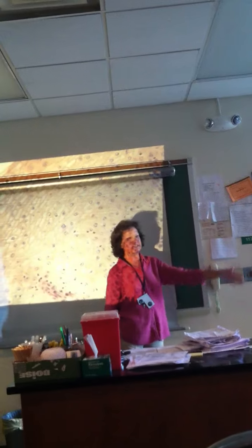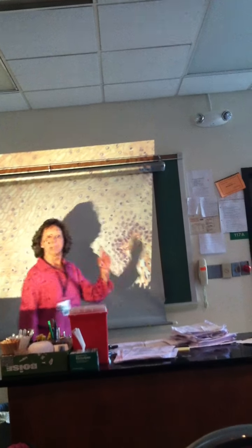This is a nice slide. This tissue you were assigned. I want you to look down here. There's something going up and down and up and down. What is that? Oh, I'm not asking what tissue is yet. What is this feature at the deepest point? Basement membrane. Good for you.